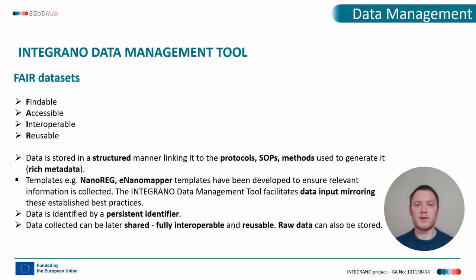So through the INTEGRANO data management tool, all of the data associated with each nanomaterial or nano-enabled product within the project can be identified and traced. So data associated with the synthesis of a nanomaterial can be traced right the way through the full life cycle of that nanomaterial, all the way through to its incorporation into a nano-enabled product, through its use phase, and right through to the end of life. So the software also allows the progress of the work to be performed to be monitored, and also the completeness of the data can be evaluated.